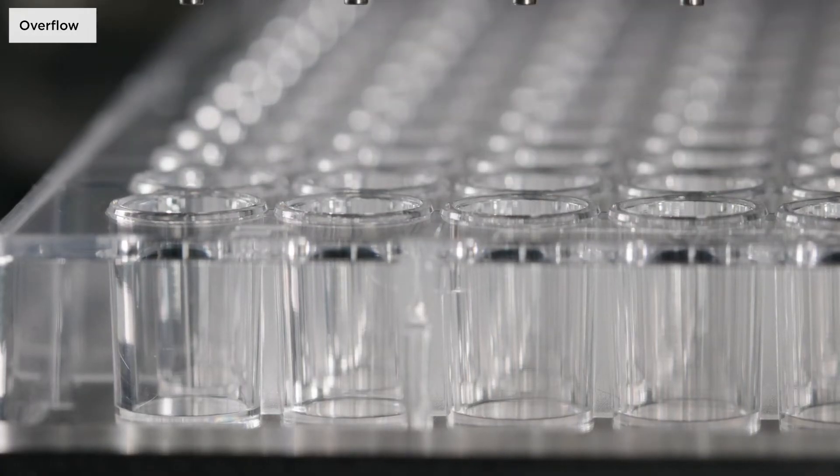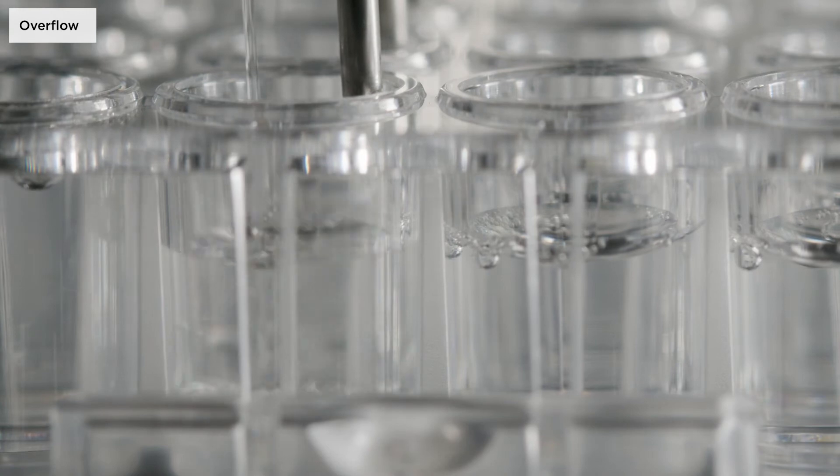The next position can then be selected. Washing, dispense, and aspiration are performed simultaneously during overflow.